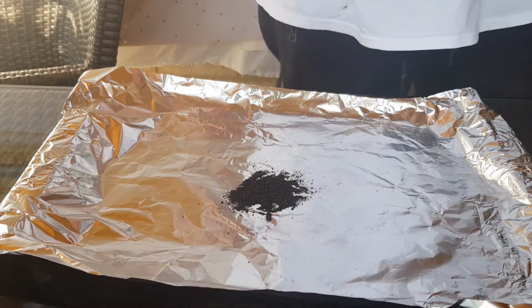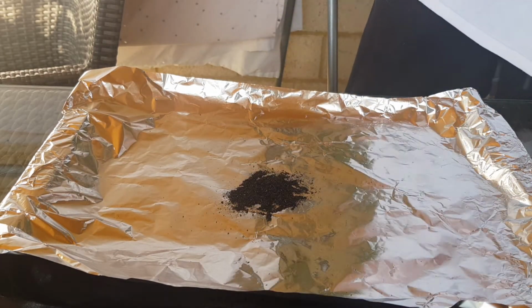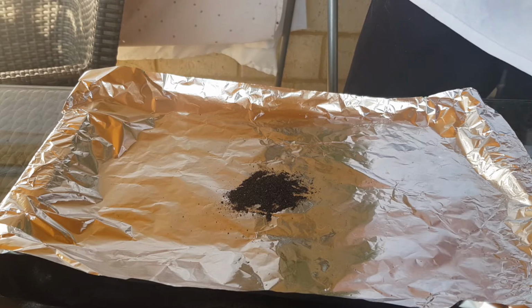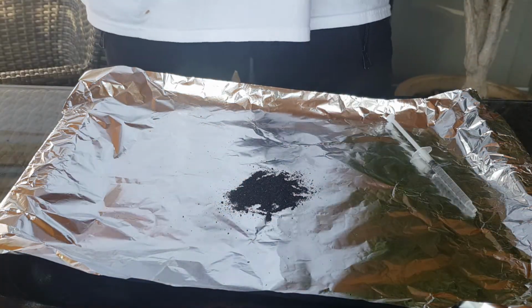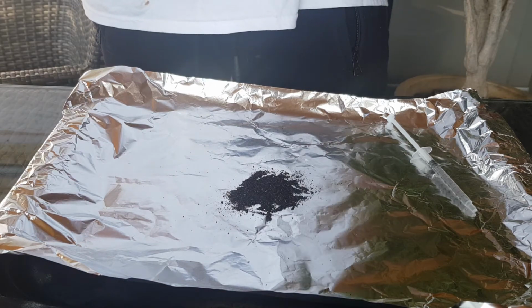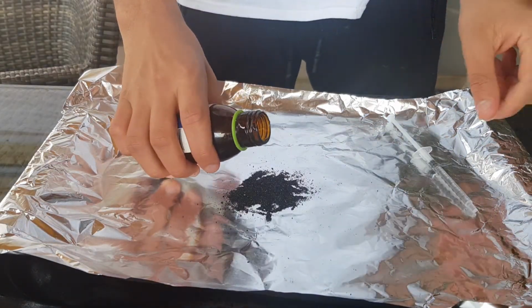You can see there's already some water on here, it's turned purple immediately. And I'm just gonna get some water because interestingly, water speeds up this reaction rather than slow it down because of the coldness of it or something like that. And now I'm just gonna add a small bit of glycerol to it. Into that little indent I made in the middle.